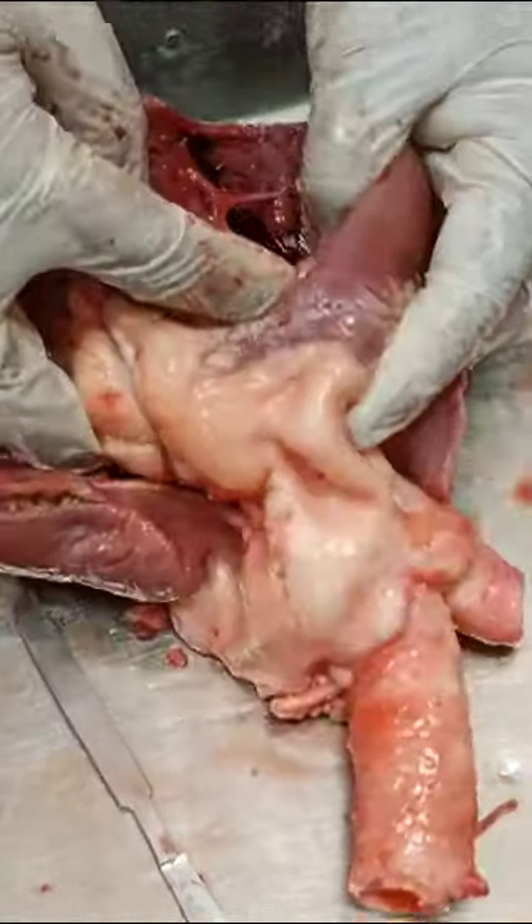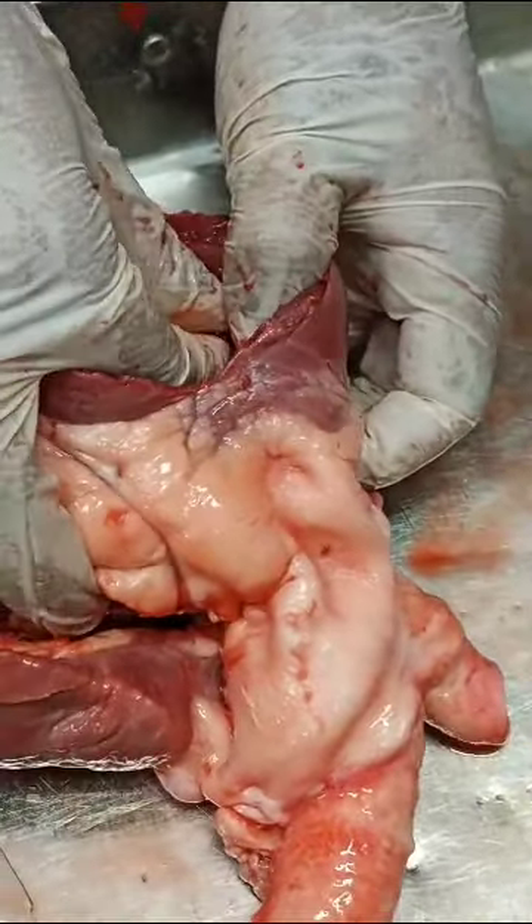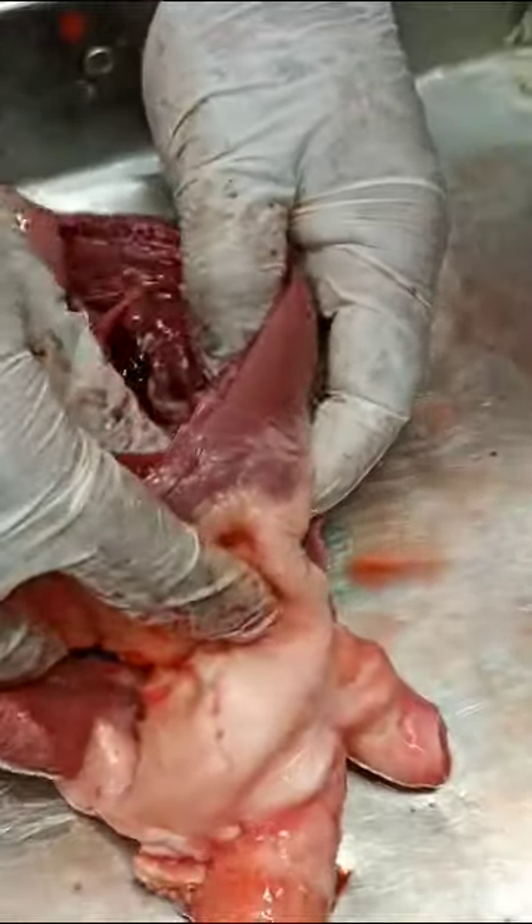Look at this. They are all looking at the papillary massage. And this is the top. This is the top.